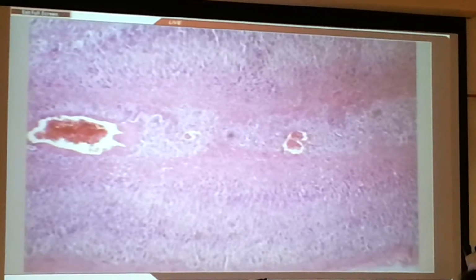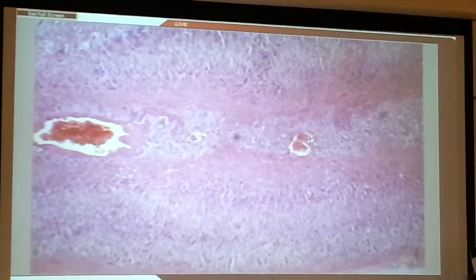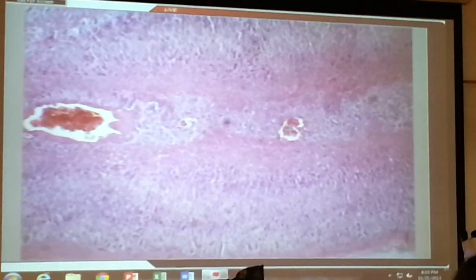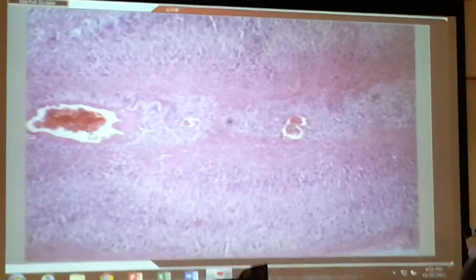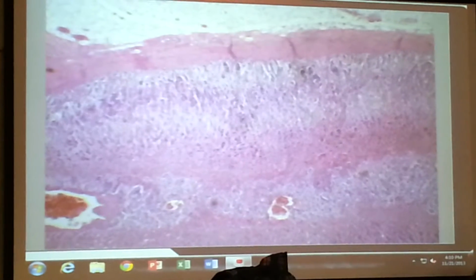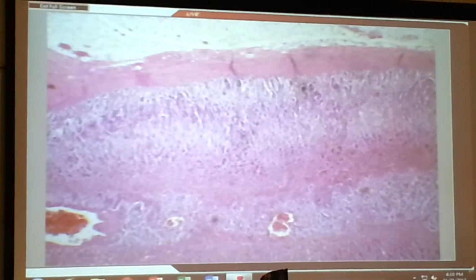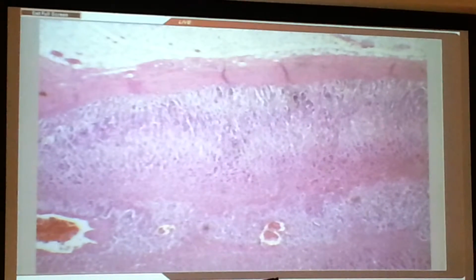So the easiest way to identify the medulla, because I know these layers start to get into each other, is that most of the time it's got these big blood vessels in it. So when you see those big blood vessels, that's a very good hint you're probably looking at adrenal medulla. Certainly when you see capsule, you know the part that's touching that is part of cortex. The difficulty is how far down does it go? And that's partly just look at those vessels and some other things.